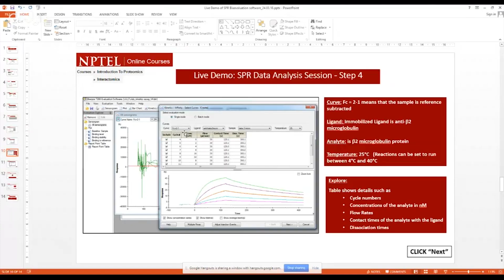If anything apart from the ligand binds, if there is something in your buffer, if something binds non-specifically to your surface, you need to know that the change in refractive index, the RU units that you're getting, are due to your ligand alone and not due to any kind of non-specific binding.